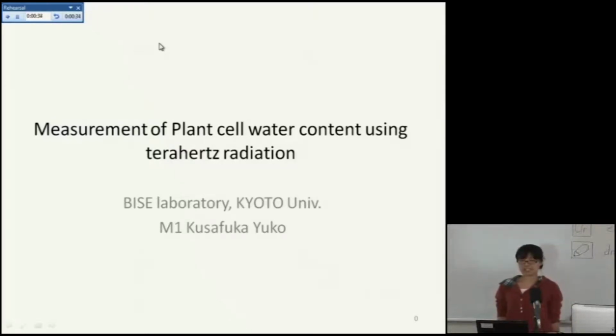Let me start my presentation, but first of all, some of you might notice that my research team has changed. My new research theme is to measure the plant cell water content using terahertz spectroscopy.